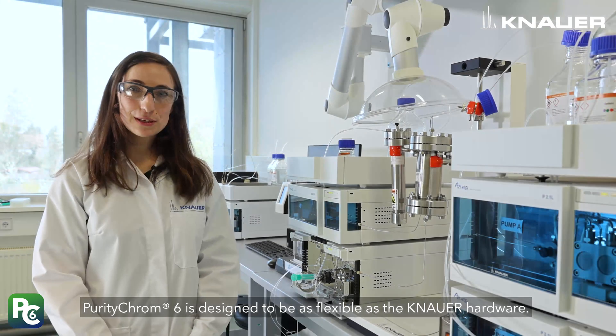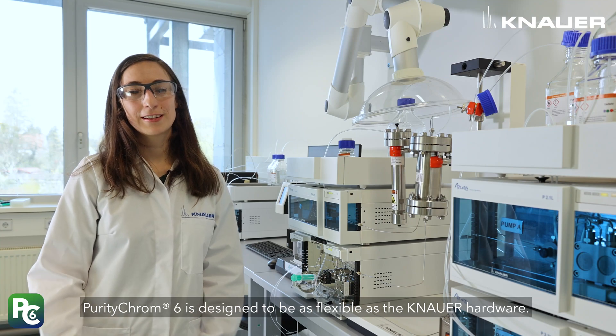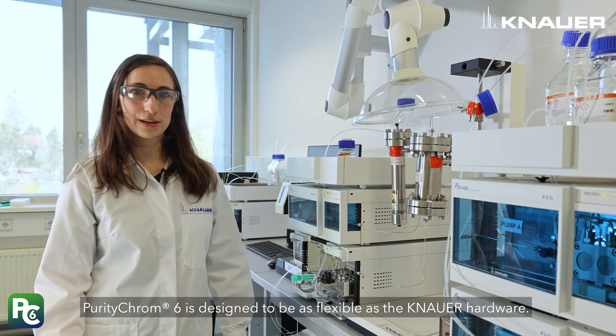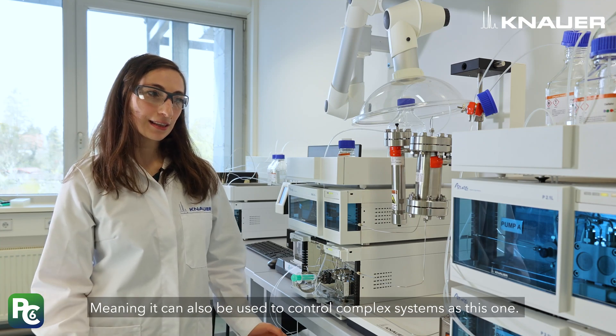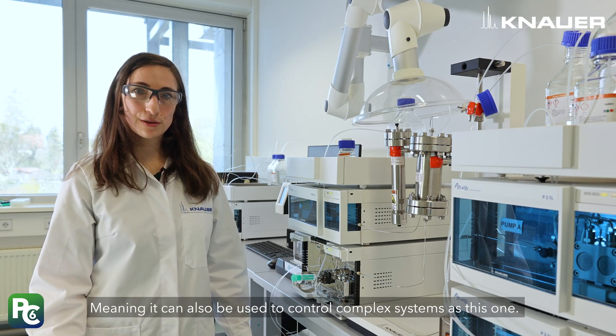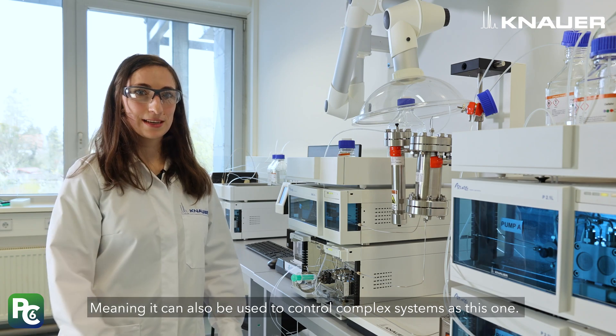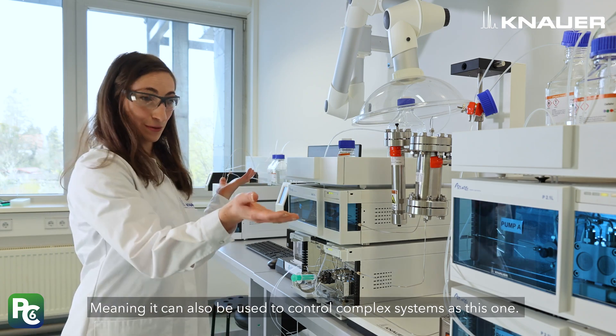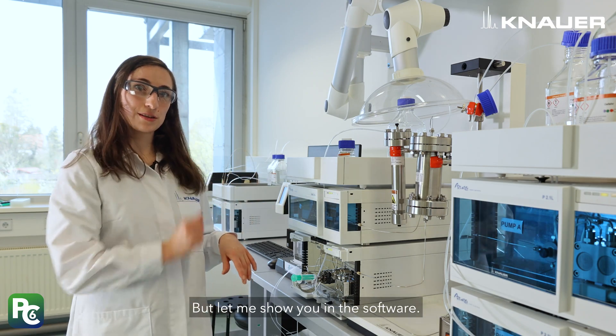PurityChrom 6 is designed to be as flexible as the Knauer hardware itself, meaning it can be used to control complex systems as this one. But let me show you in the software.